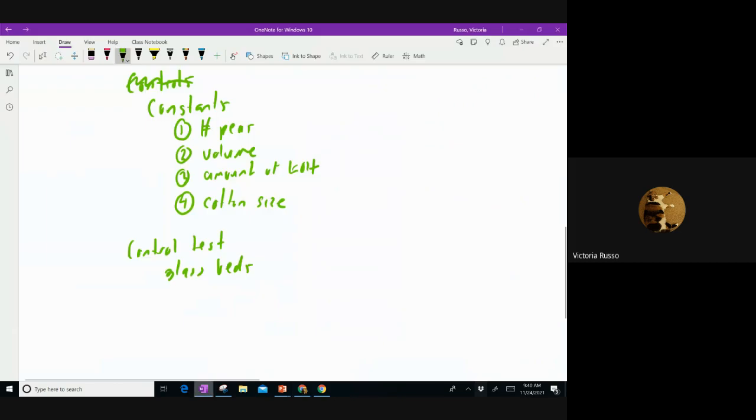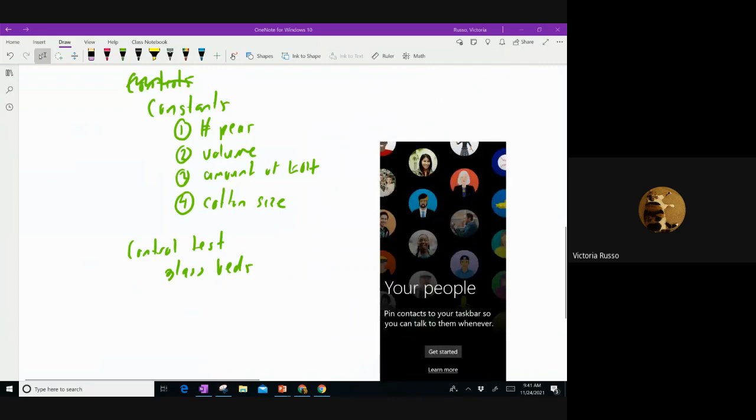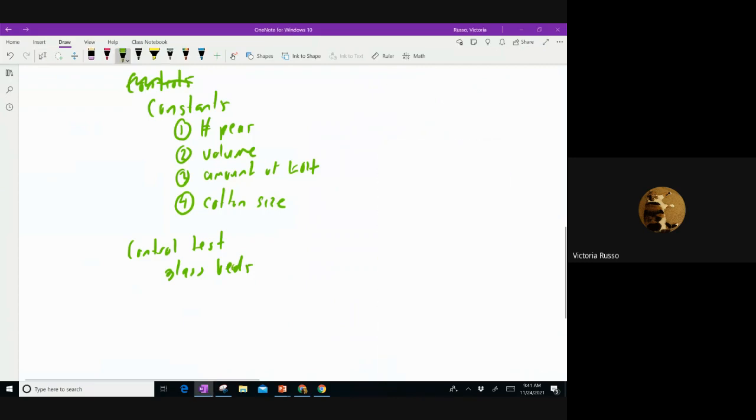All right, so we are back. I apologize for that. So we're going to do a control test, which is going to have no peas, just glass beads. And you're going to watch another video of a man doing this lab, so it makes more sense after you watch this one. Now, the purpose of this control test is there should be no changes. Glass beads don't do respiration. So if something changes, that means there are other factors affecting the experiment. So we're going to use the glass beads, and I spelled beads wrong, to subtract out any changes that occur.